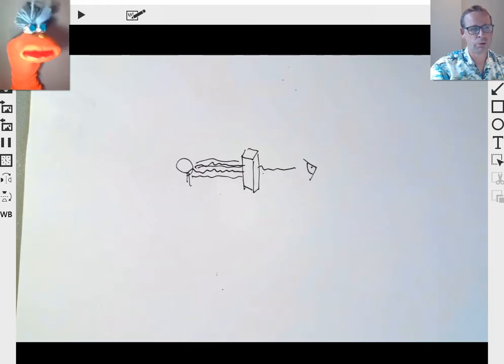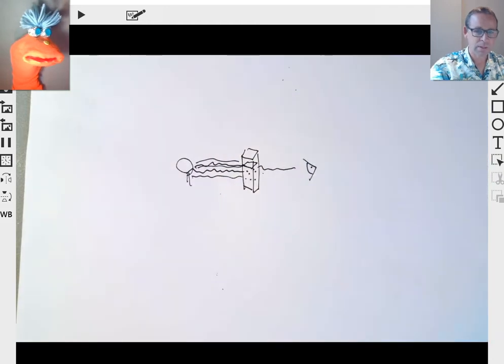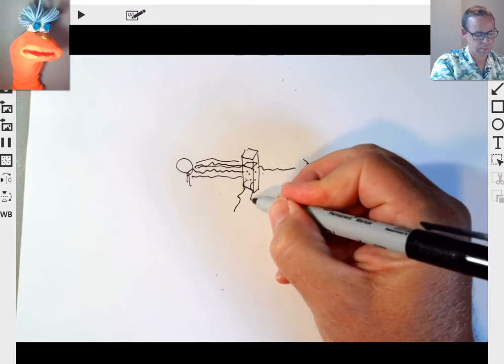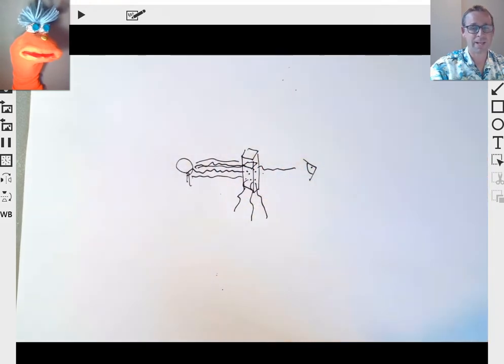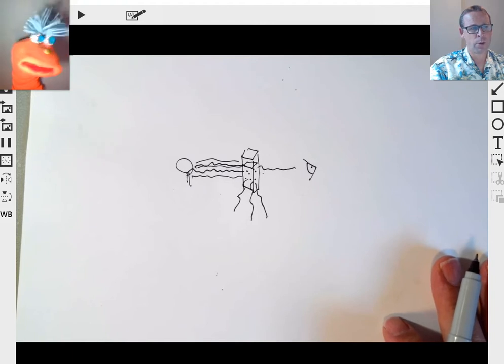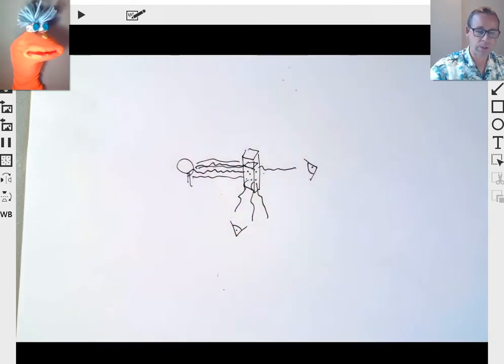Yeah, but fluorescence, you look at a different angle. That's right, because as the analyte in here absorbs that light, oftentimes it will re-emit photons of energy of a different wavelength. And what did we say the relationship between the wavelength of light that is absorbed compared to the wavelength of light that is emitted? It emits lower energy, so that means it's a lower frequency, and it has a longer wavelength.